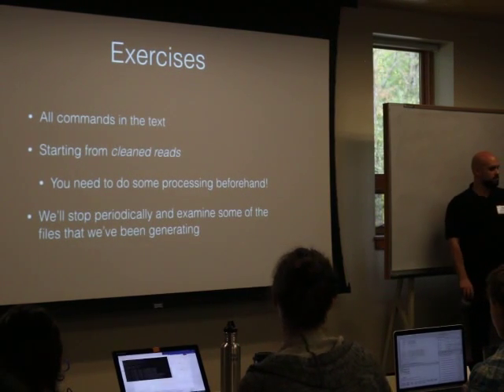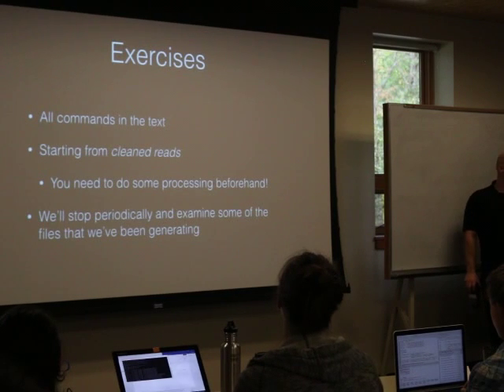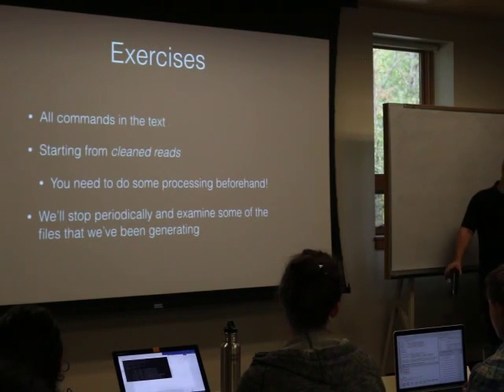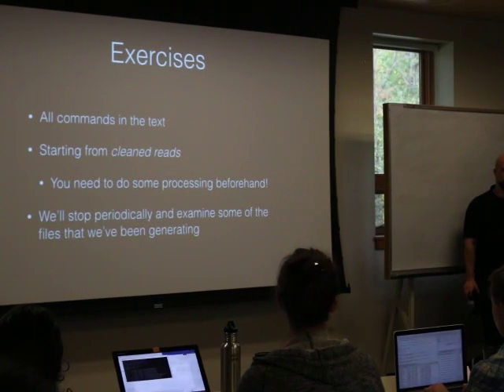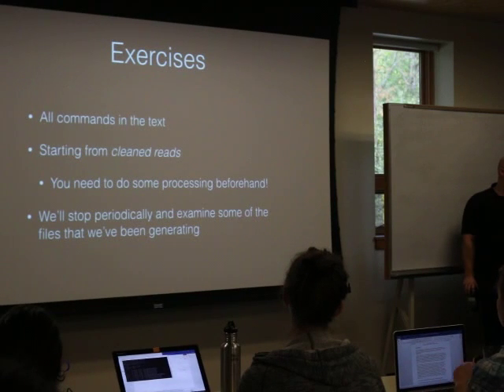So, to introduce the exercises, every command I want you to run is going to be in the worksheet, and we're going to be starting from clean reads. Again, I'm going to go over a little bit how you might expect to do some data pre-processing. And depending on the flow and how everyone's progressing, we might stop and examine some of the individual data structures.